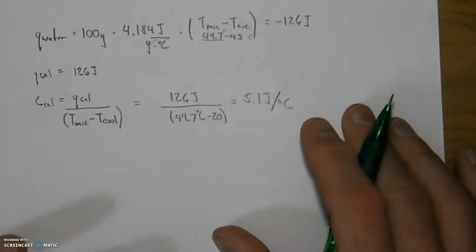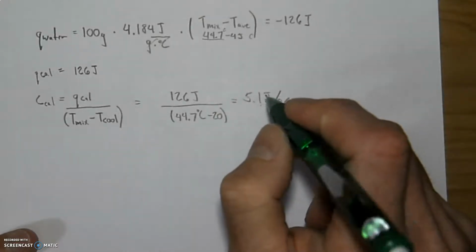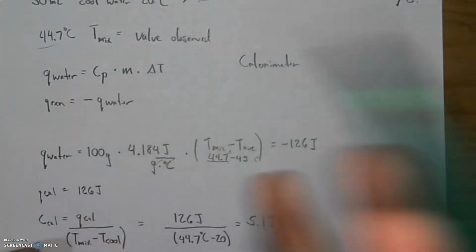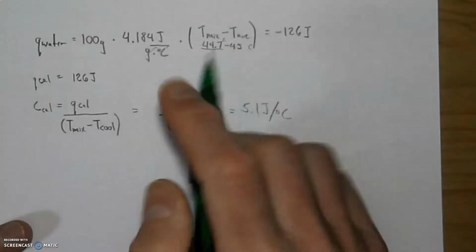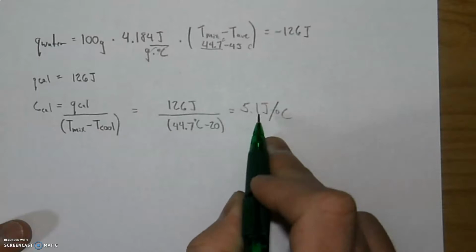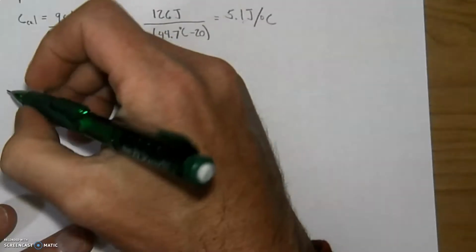Okay, so what this does for me is it allows me to be a lot more specific when I'm doing that Q, Q cal or QM cal, whatever you guys call it, a reaction, when I'm looking at here. I can be a lot more specific because there's some missing energy, right? It's like, well, where did this energy go? I can now bring this into the conversation and be a lot more exact in my answer. So let's look at how this would play out.